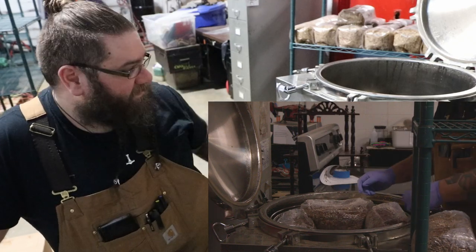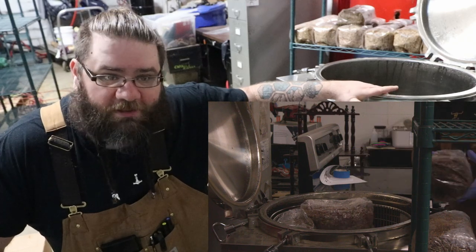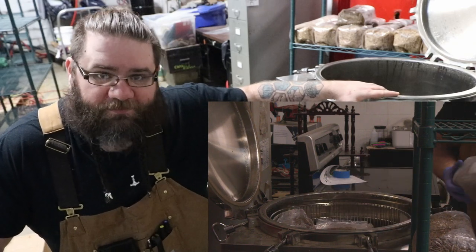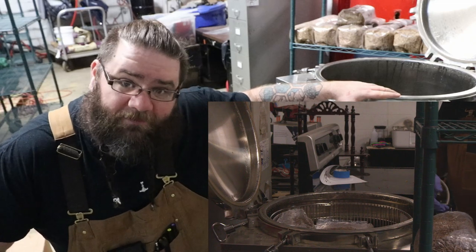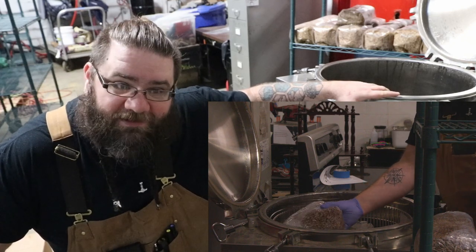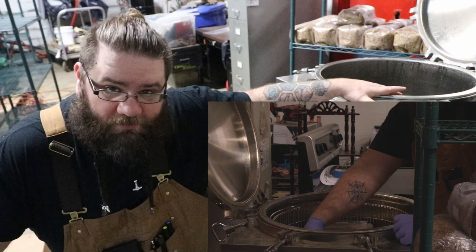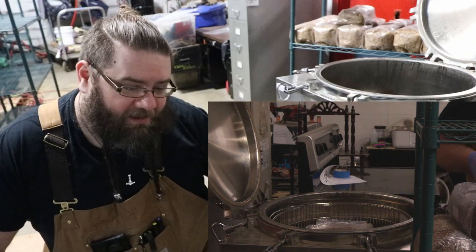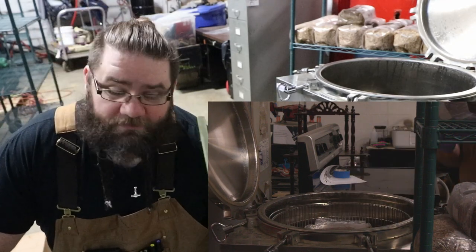The real big difference in this is the level of heat that it can attain and the level of pressure that it can attain. Autoclaves are really for very good sterilization practices, pretty much the best sterilization you're going to be able to get, which is why I can reduce my time from 2.5 hours for 4 bags of grain like I used to do in my All-American to 50 minutes for 23 5-pound bags. That's because I'm able to go up in temperature, and this thing gets the temperature so quickly. So this is probably the best sterilizer out there, but I will say it maintains pressure by amping up the heat, and then sometimes it's got to kick out a little steam out of this hose. You've got a little exit hose for your steam. It scares people sometimes.